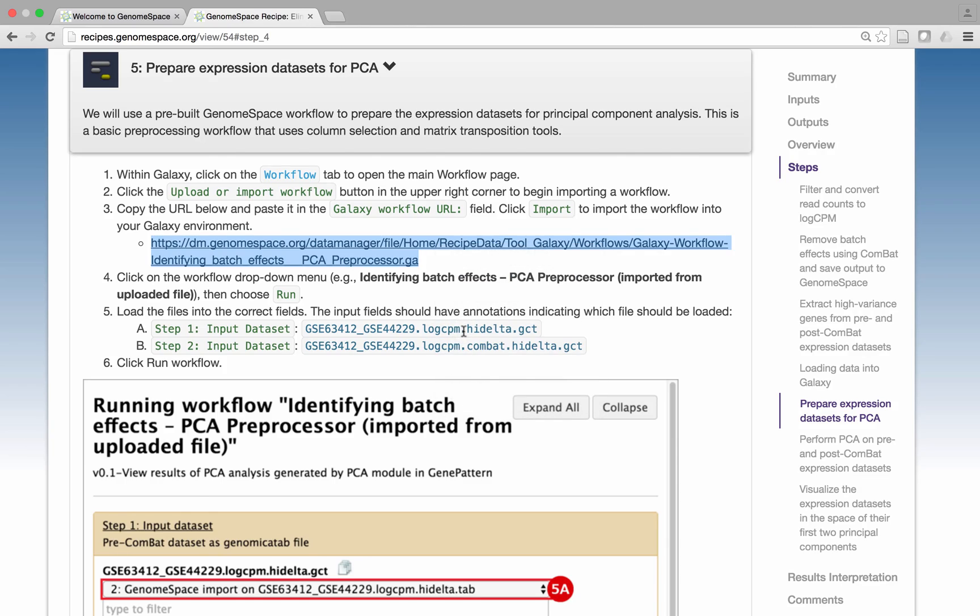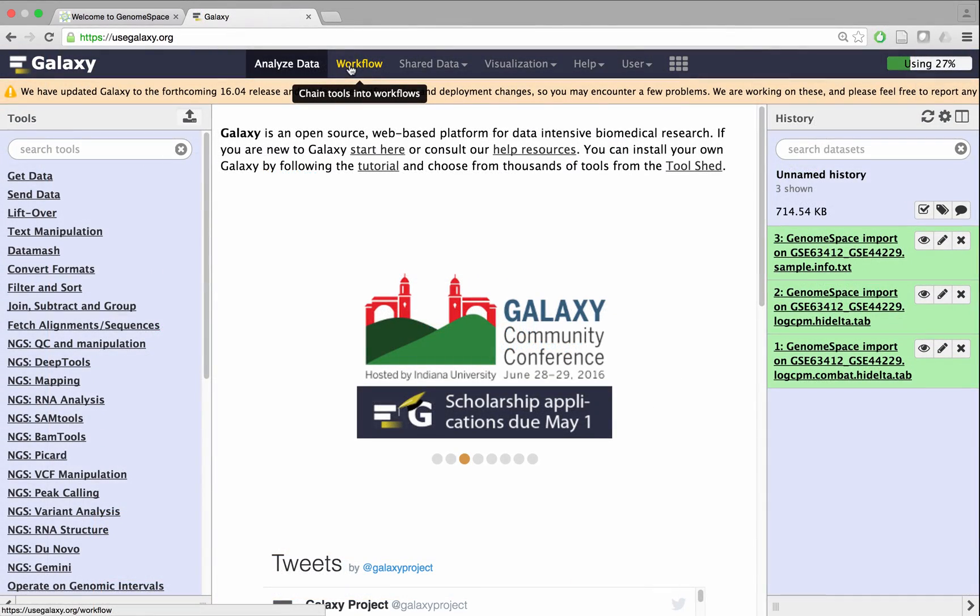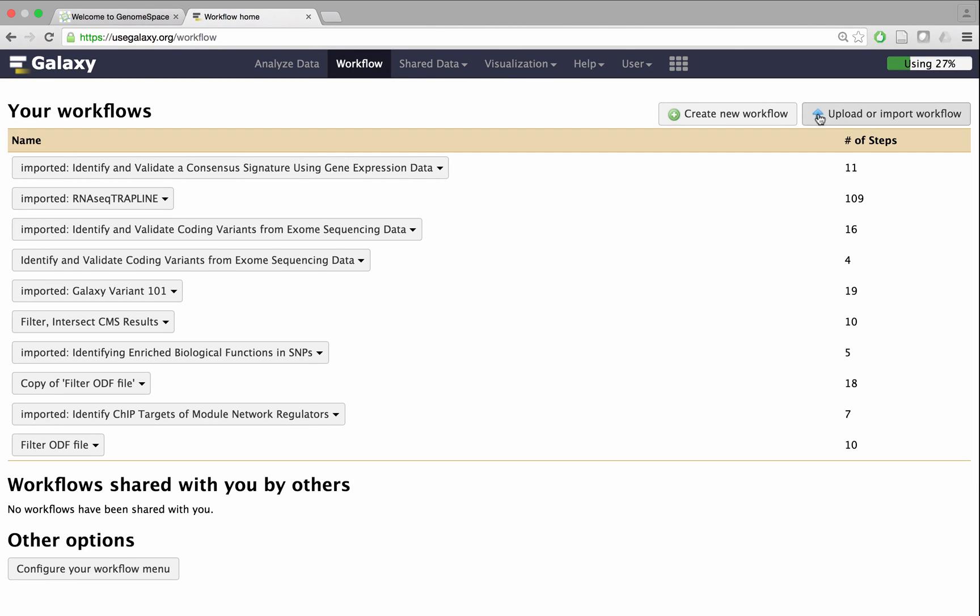Return to the Galaxy homepage and click the Workflow tab to access the main workflow page. Click the Upload or Import Workflow button.